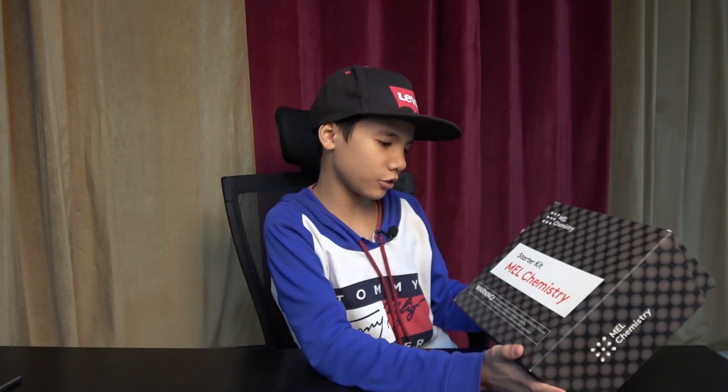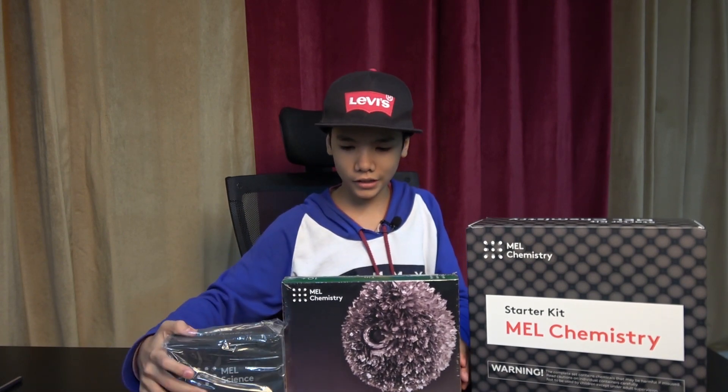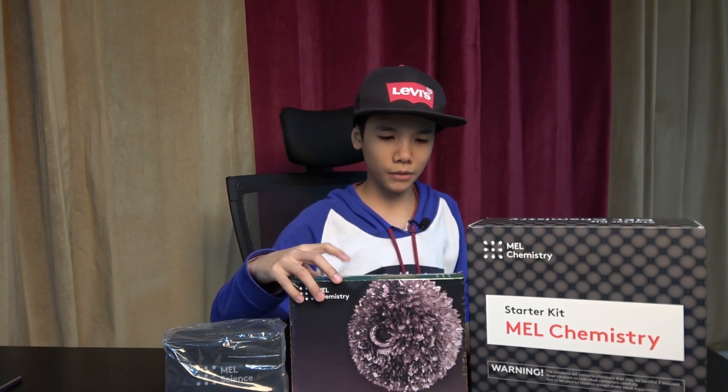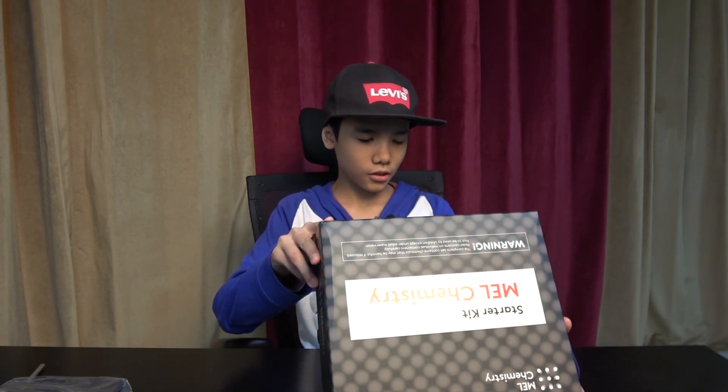It's a starter kit — the Mel Chemistry starter kit — and there are lots of warnings on it. So here's what came in the first package: a VR headset, some tin which I'm guessing is the experiment, and this is the starter kit. We're going to open the starter kit first.